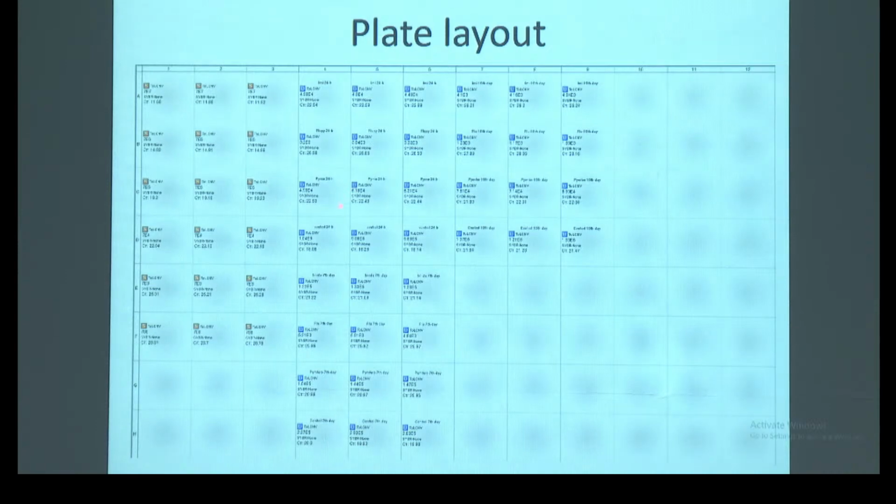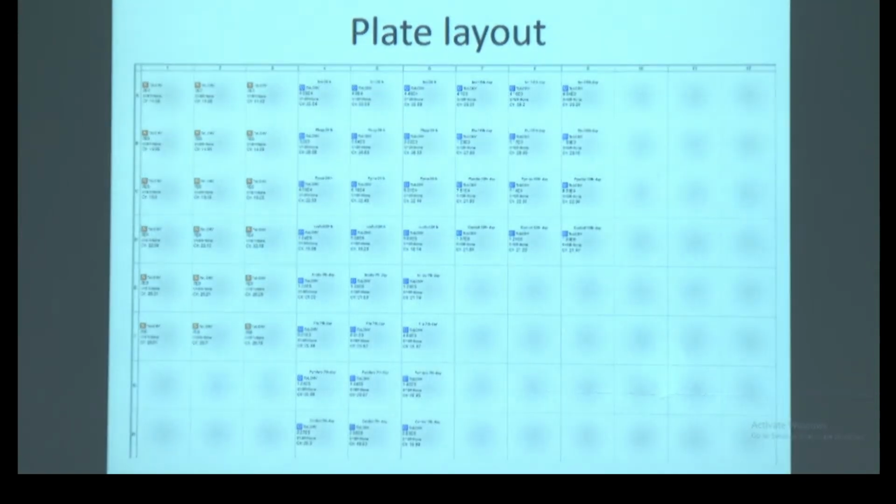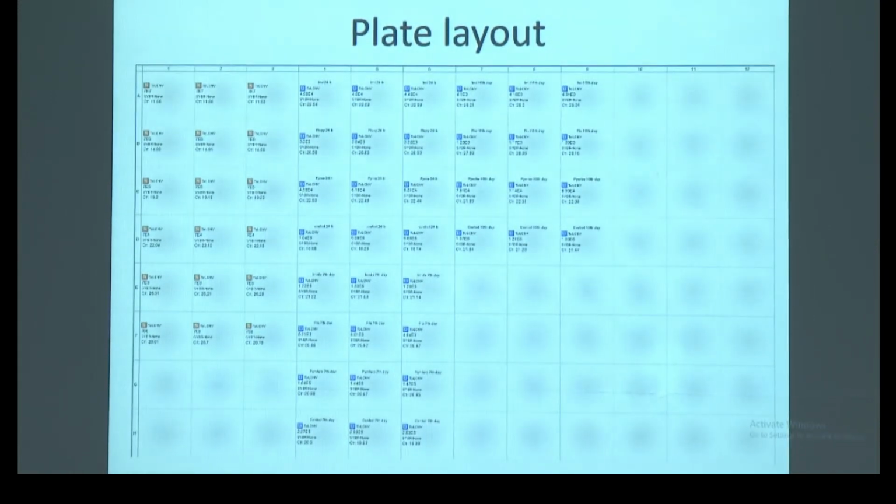So unknown samples will give some CT value. The machine algorithm will automatically calculate the quantity of DNA in each sample. इधर दिख रहा है आपको थोड़ा प्लेट में? दिख रहा है? नहीं दिख रहा, थोड़ा छोटा है, कोई बात नहीं, ठीक है. So we will see in practical.